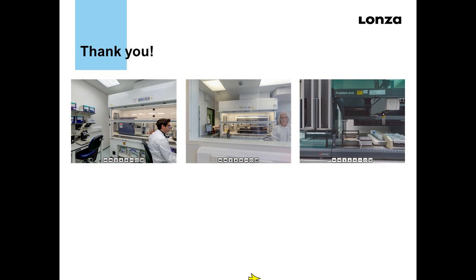In this particular example, the only 3 glycans we were concerned with were G0F, G1F, and G2F. And for those glycans, we saw only up to a 0.2% difference between the data.